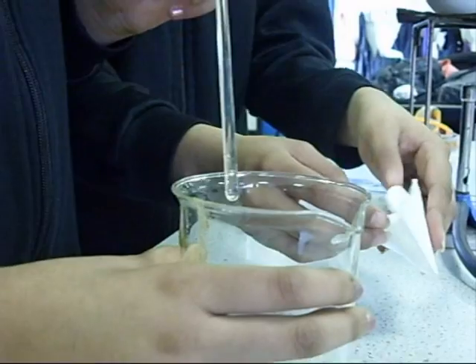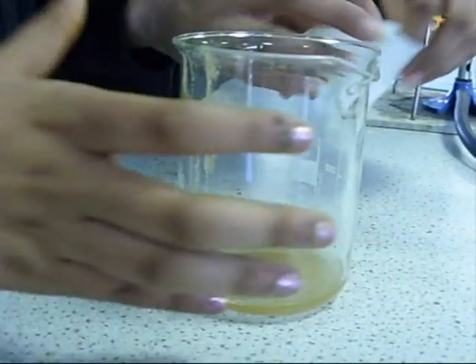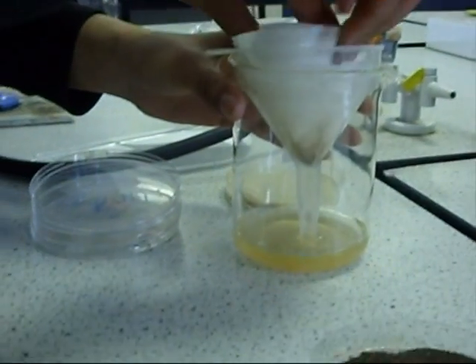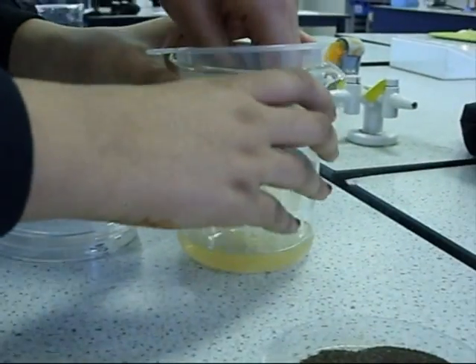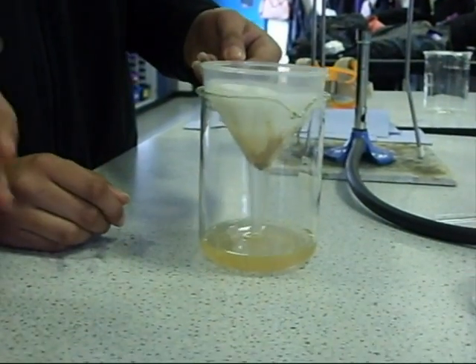Once you've set out a filter paper in the shape, you can just fold it like this and then just turn it around. Then put it inside a funnel so that it stops all of the solid material. Now pour the liquid little by little so that it doesn't overflow.